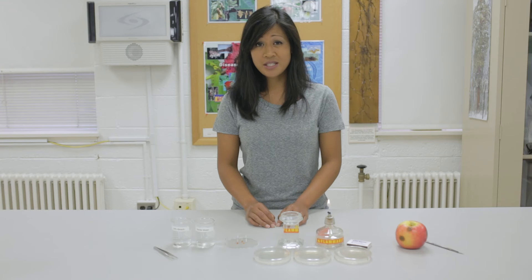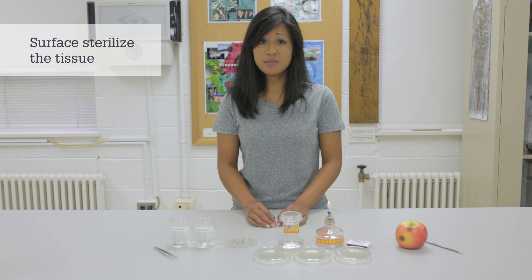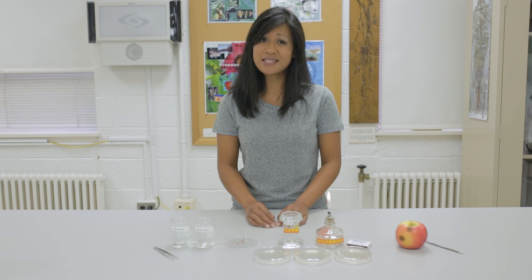Once we have several pieces of tissue, we need to surface sterilize them. This step should kill all organisms except for the pathogen that is growing inside the tissue.